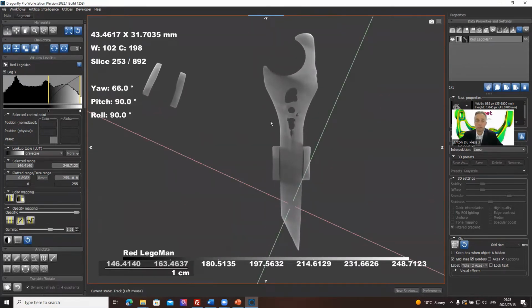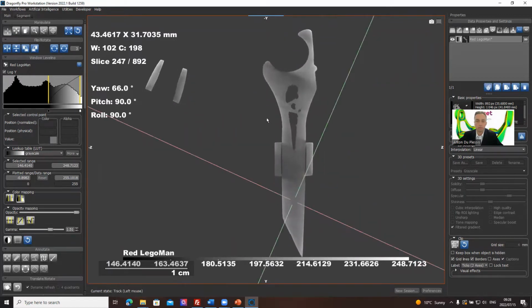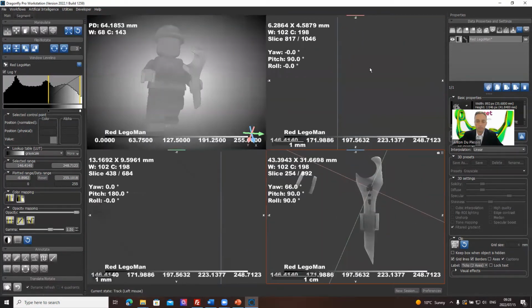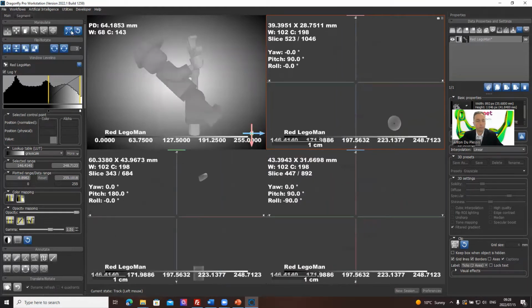So it's not turning the data at all. It's just very simple, very fast ways of getting a nice angle. If we do that, we're seeing the data in all views. And if you're now losing anything like that, you can go back to the original view and reset things. At the moment, things are slightly invisible there because of this strange contrast.